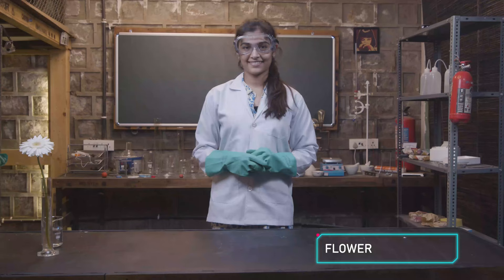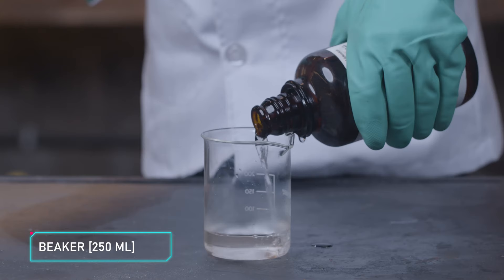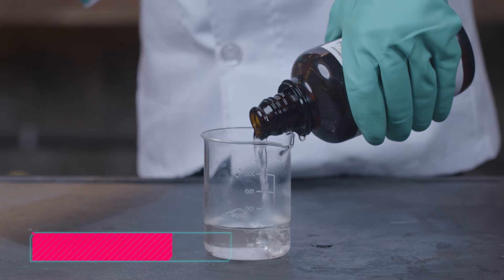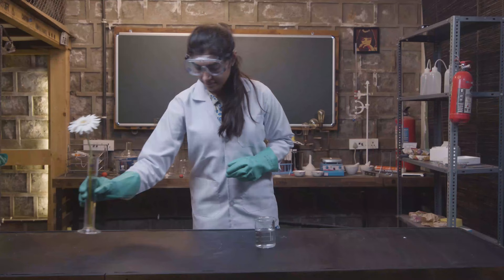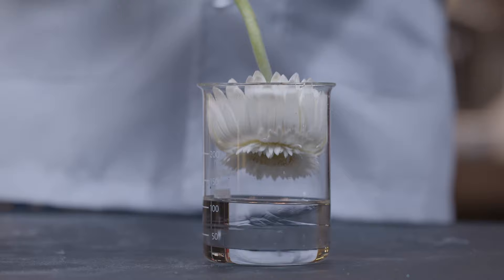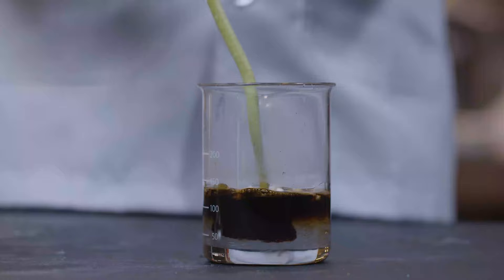First, we'll experiment with a flower. Take a beaker and pour in sulfuric acid till the half mark. Now grab your freshest favorite flower and dip it into the beaker. Do you observe how it wilts almost instantly and turns into this black liquid?